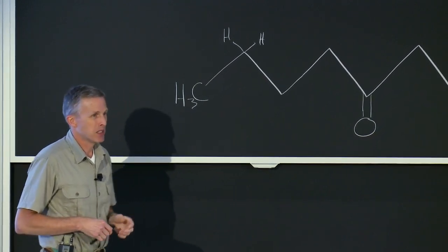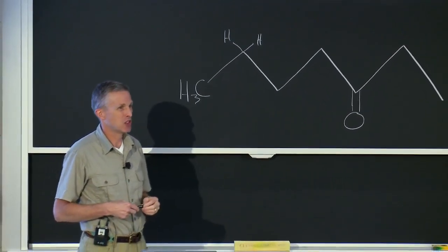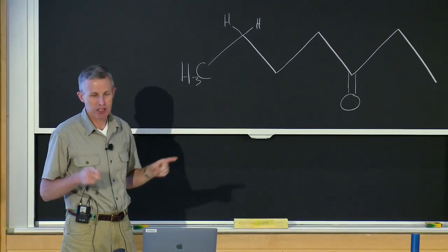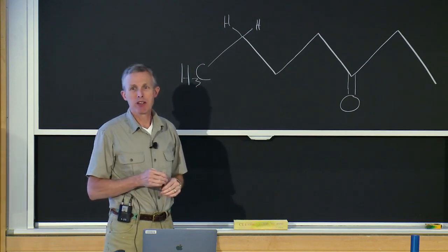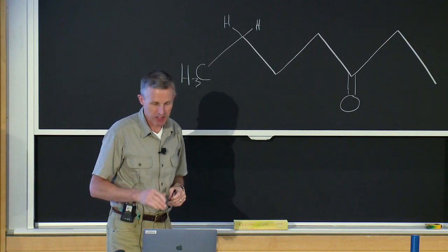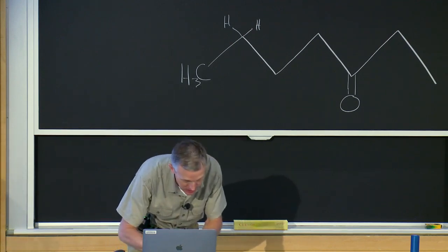Splitting can be completely non-rationalizable. Generally, there are several ways that can happen. The most common way is when the difference in chemical shifts between 2 nuclei is not much bigger than their coupling constant. You'll just get a whole bunch of different peaks. I can drag up an example of that in a second, so let's see.